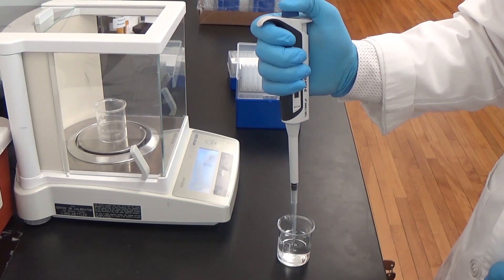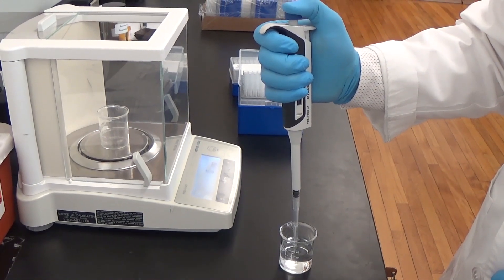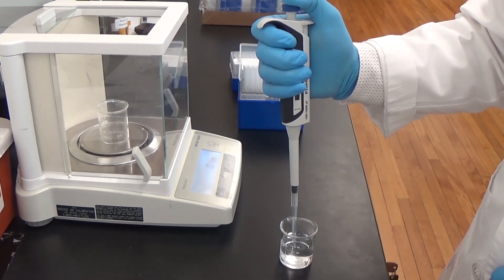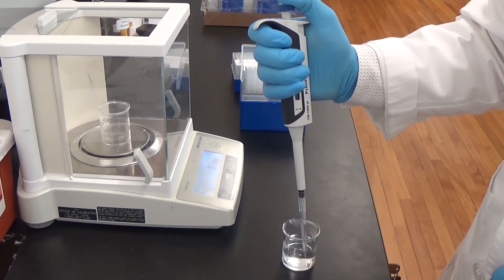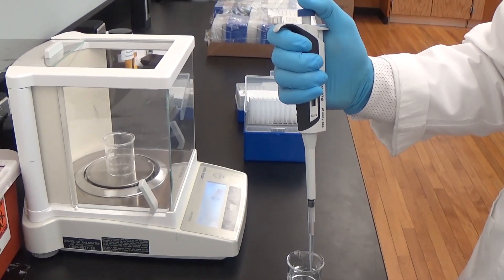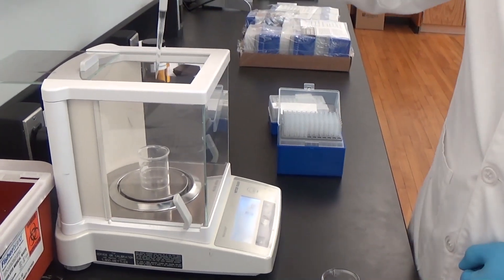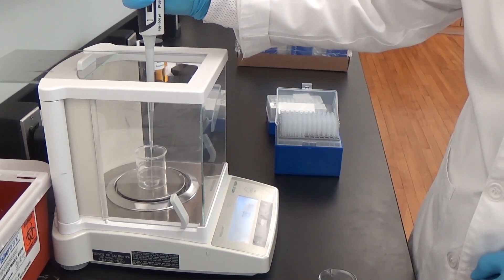This micropipette has been calibrated by the manufacturer. Now we will check the delivery accuracy of the micropipette using deionized water and an analytical balance. This can simply be done by checking the weight of any specific volume.